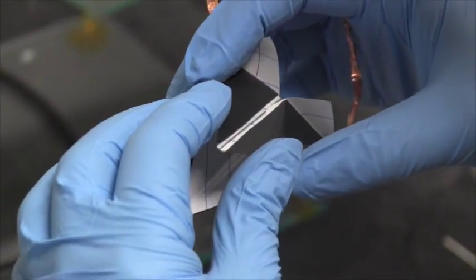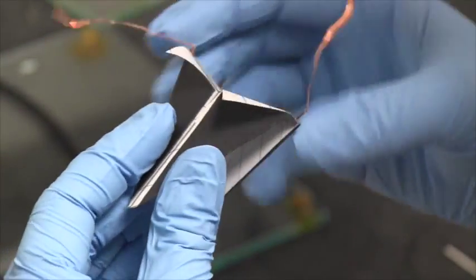My work is going to continue with the terpolymer but also adding the MAE, which is magnetically actuated material. I am looking at making a biomorph, so we will have one sample that will be actuated electrically and magnetically.